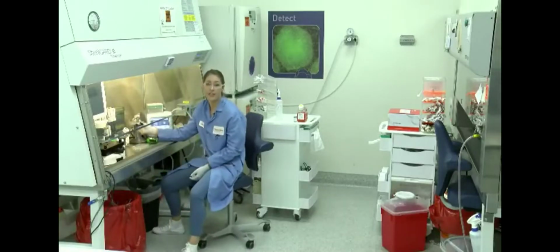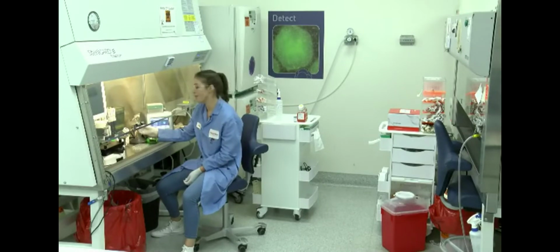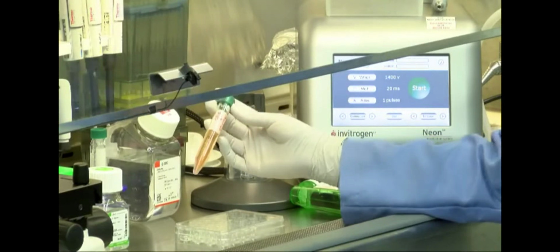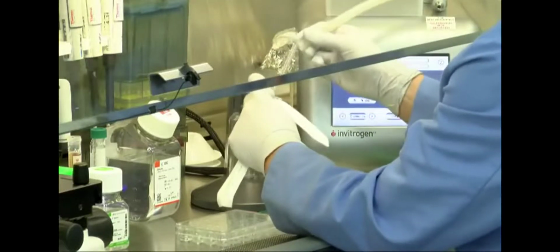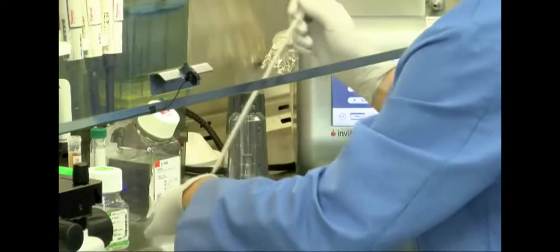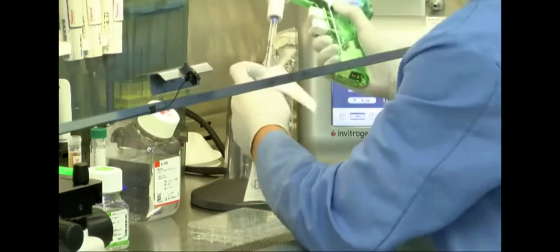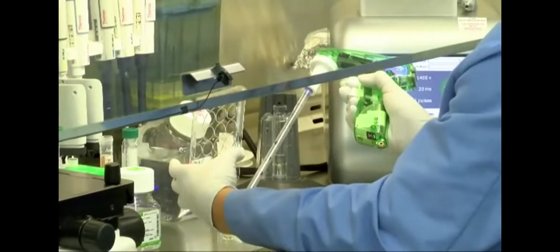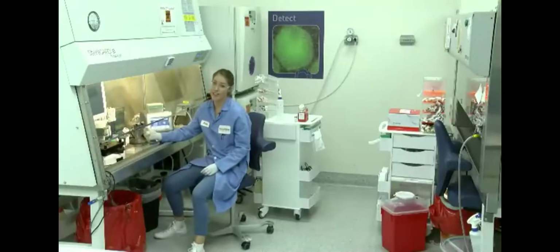I've already prepared the StemFlex media with RevitaCell, and I'm just going to add a half mL of media per well of my 24-well plate. You want to prepare as many wells as you have transfections to do. Since I'm just demonstrating today, I'm just going to prepare one well. You just want to aspirate off the laminin 521 that's already on there, and then add a half mL of your StemFlex plus RevitaCell. Now our destination plate is ready and our cells should be dissociated.